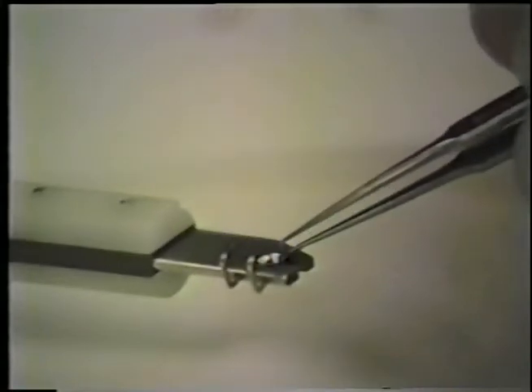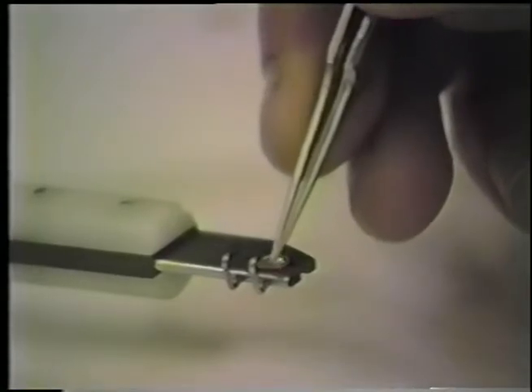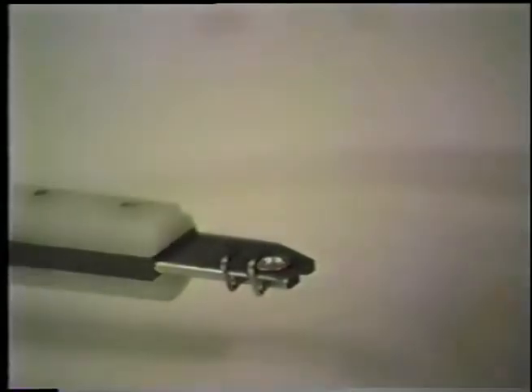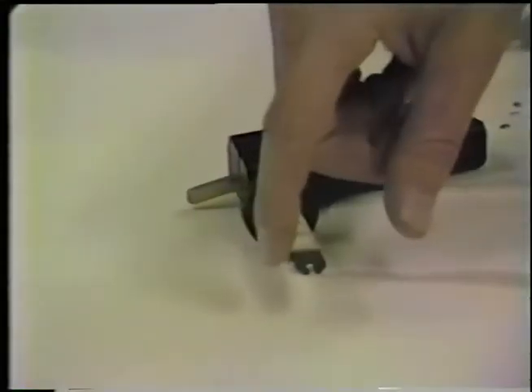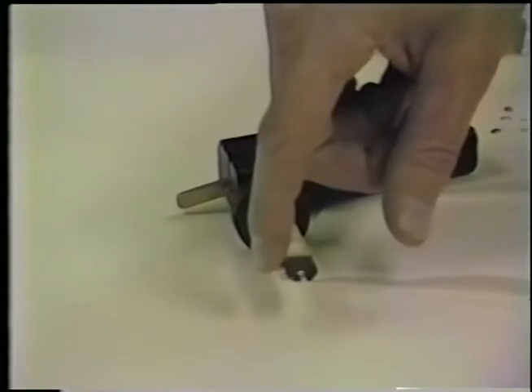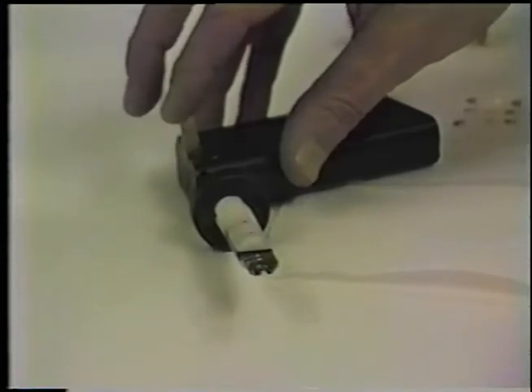Then pick up the top specimen carrier and apply it to complete the sandwich. Center it if necessary. We then rotate the thumb lever on the sample holder to lower the forks, which actually hold the sample in place in the sample holder. We're now ready to freeze the sample.